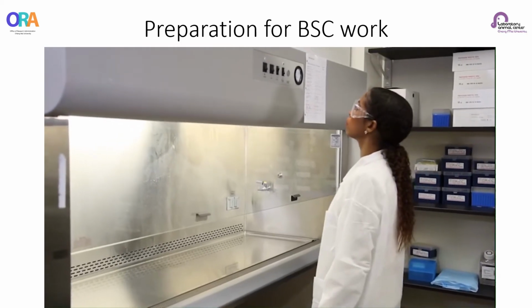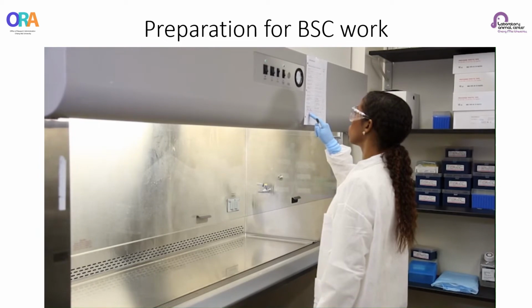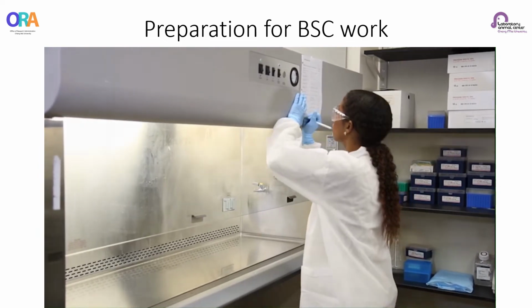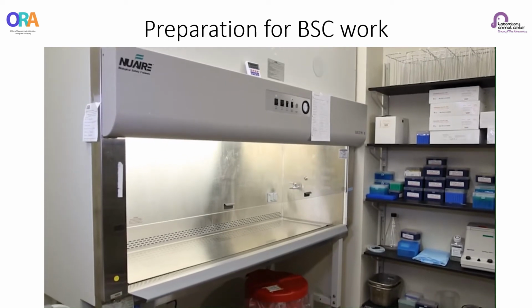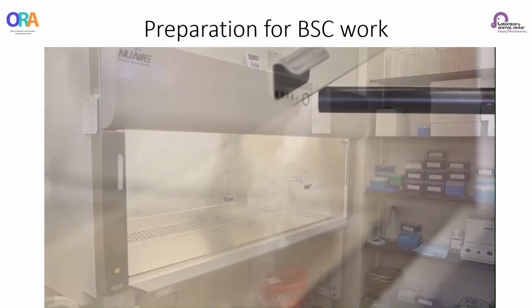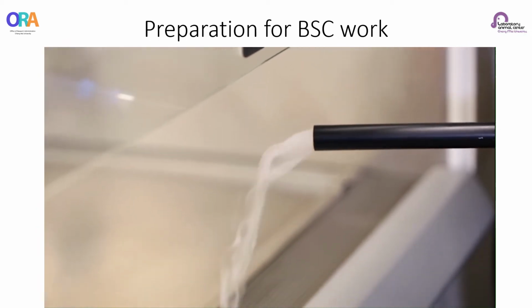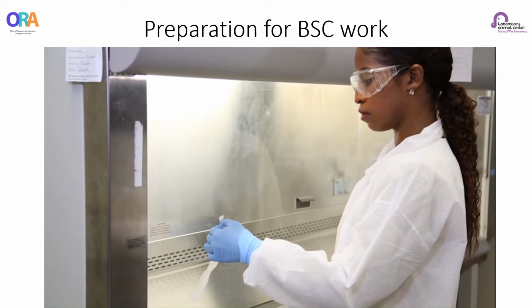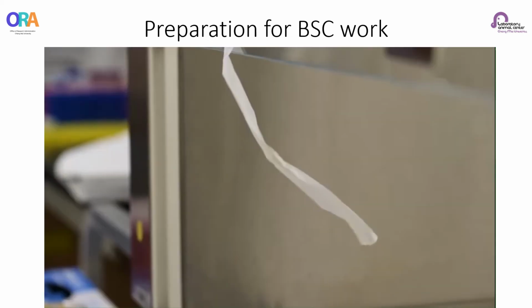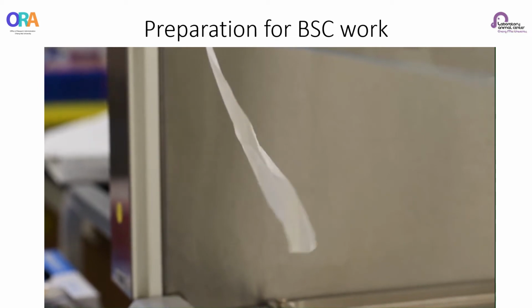Some labs keep a pressure gauge log taped on the BSC and record the daily readings. That way, you can see quickly if there has been a significant change from the previous day. Inward airflow should be verified prior to use. You can use a smoke generator, or you can tape a tissue to the bottom of the sash. The tissue should be drawn into the cabinet to show inward airflow.